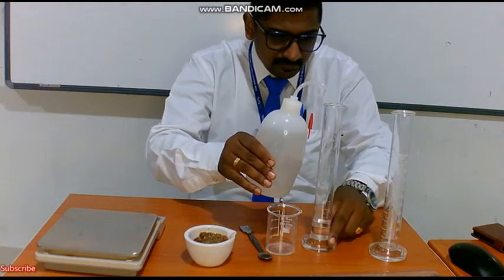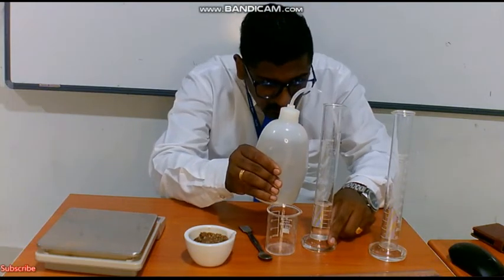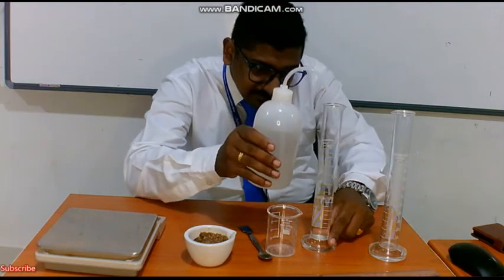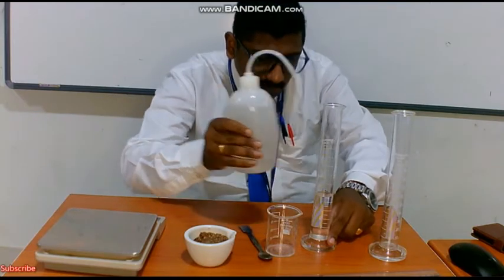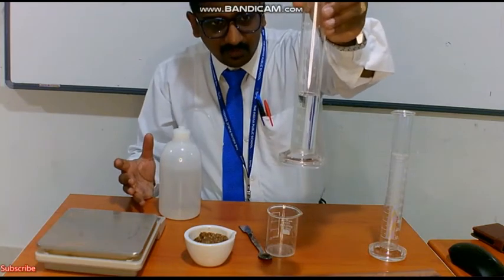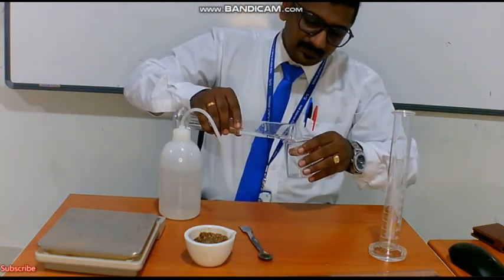We have to take 50 ml of water, and always we have to see only the lower meniscus. I am adding water until I get 50 ml. I have taken 50 ml of water - in the readings you can see we have 50 ml of water. Now I am going to pour it into the beaker.